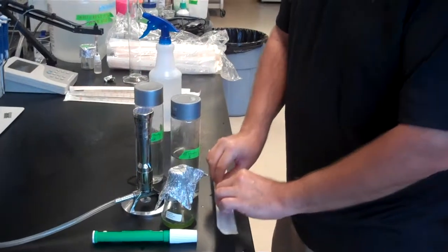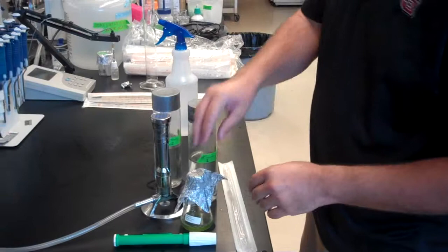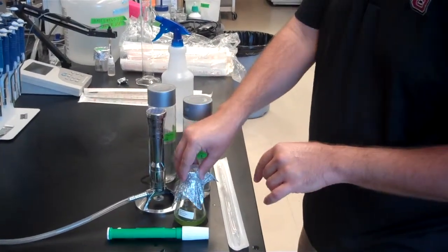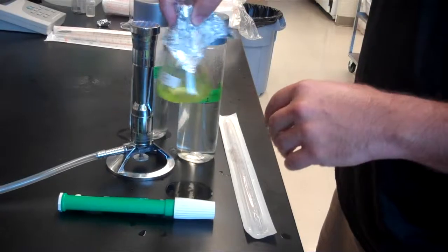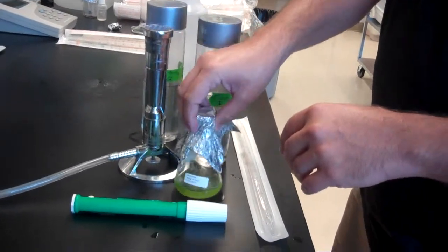This is a sterile 10 milliliter pipette that I'm going to put on this, but before I do that, every single time I dip into this algae, I want to resuspend the algae so I know I get a nice even cell count every time. So just swirl it around a little bit, make sure that you're suspending the algae, and I'm going to do this as often as needed. Okay.